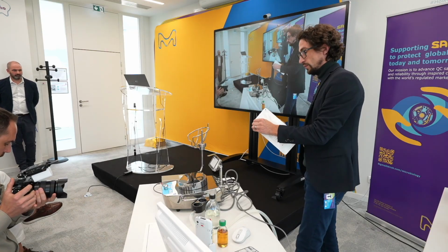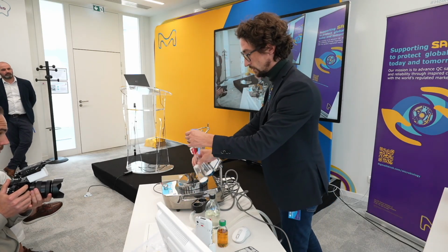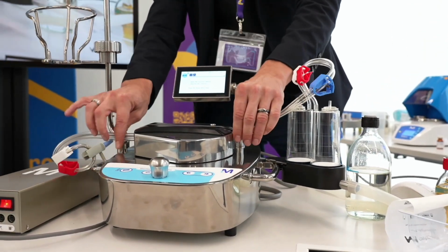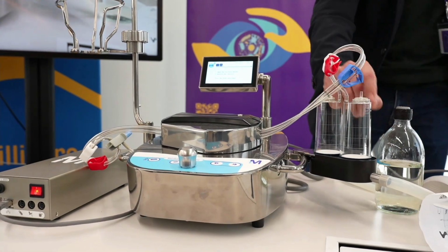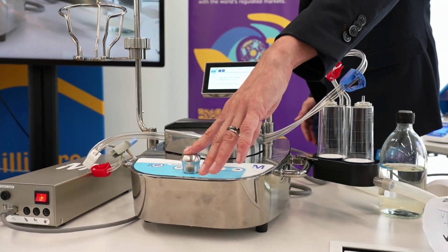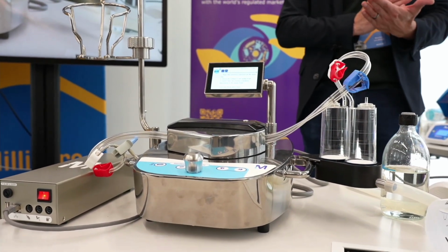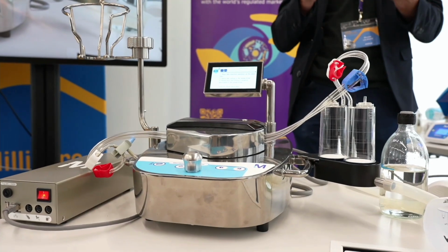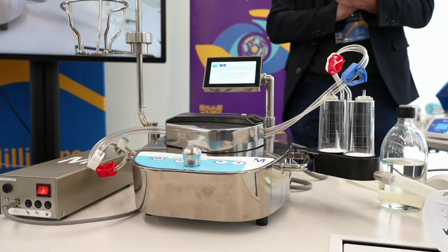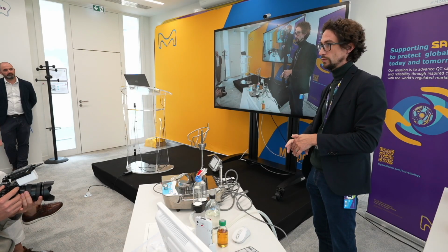So I will open my blister with a strong noise, install it in the Symbio pump. I will label my canister. And when I am done, I will press on the knob, which for mtrace is a confirmation that I have done a step. That means that every step that you think is mandatory to be assessed by the operator and written in the final report, we can integrate it in the mtrace execution.